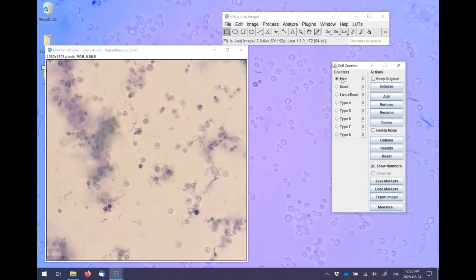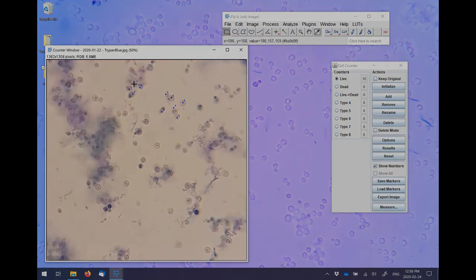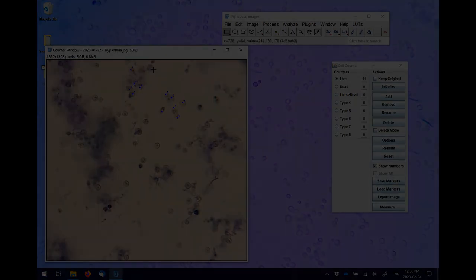Next, click on each live cell in the hemocytometer image, following the rules for proper hemocytometer counts. If you're unfamiliar with using a hemocytometer, please see Video 8 of Microbrews.